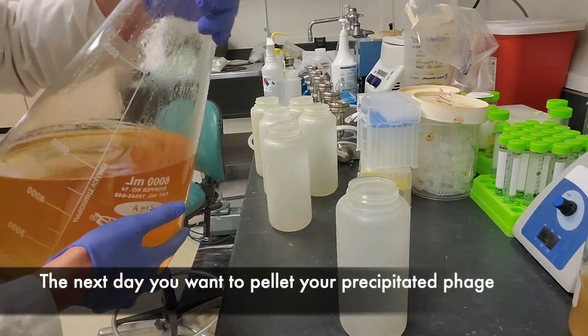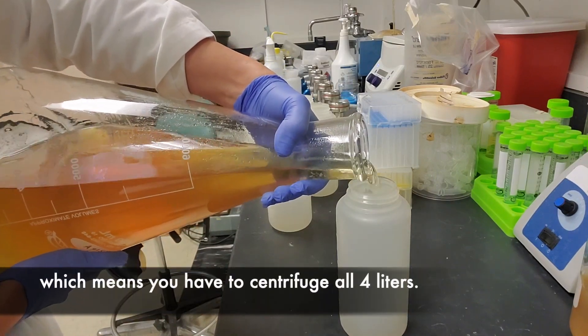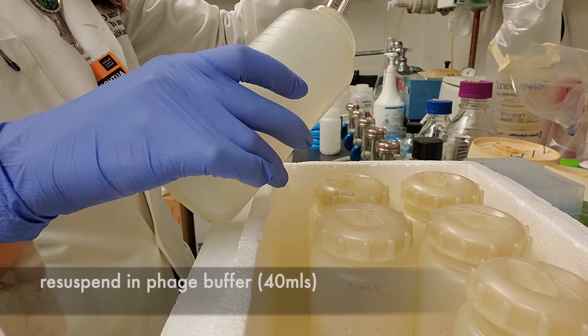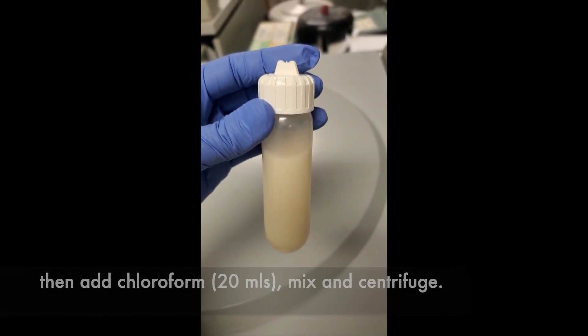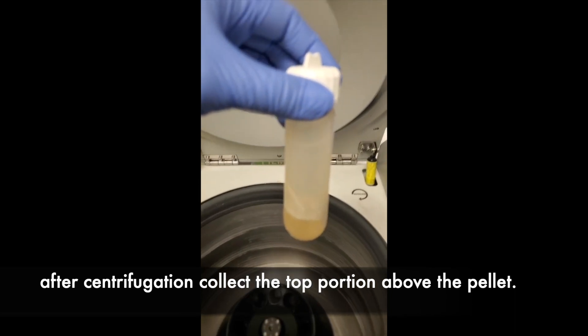The next day, you're going to pellet your precipitated phage, which means you have to centrifuge all 4 liters. Your now-pelleted phage will look like streaks on the side of the bottles. Resuspend in phage buffer, then add chloroform. Mix and centrifuge. After centrifugation, collect the top portion above the pellet.